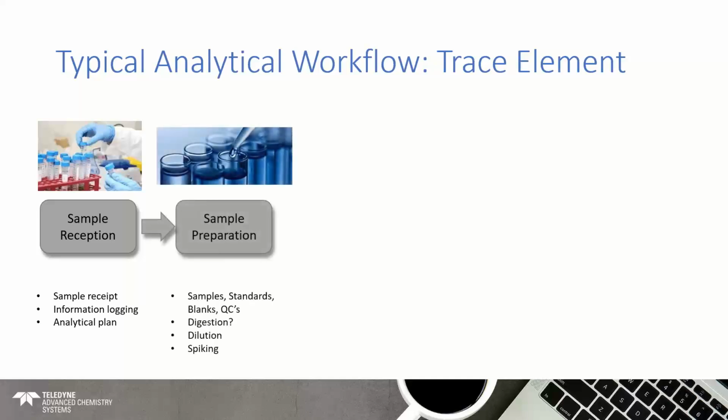So the next step, based on your analytical plan, is preparing these samples. Samples will need to be prepared and put into a state ready for analysis. Now, when we're talking about trace element analysis, we're not just talking about analyzing the samples, we're also talking about analyzing a number of other reagents and solutions with these samples, so that we get our robust quantified data. So we're not just talking about samples, we're talking about calibration standards, blanks, QCs, etc. All of that has to be analyzed as well.